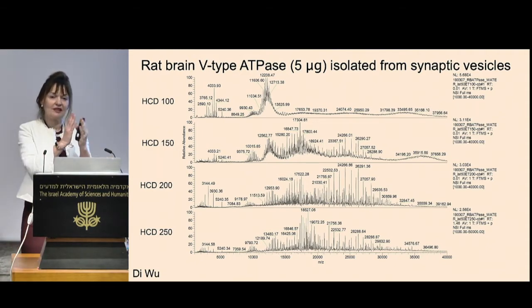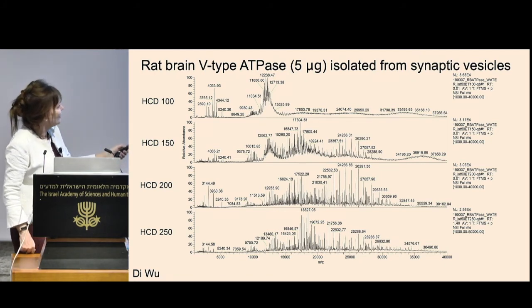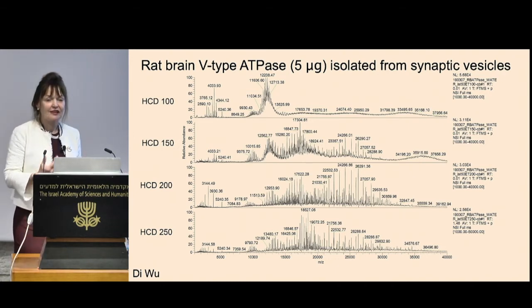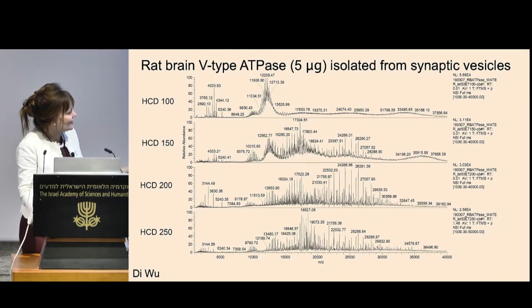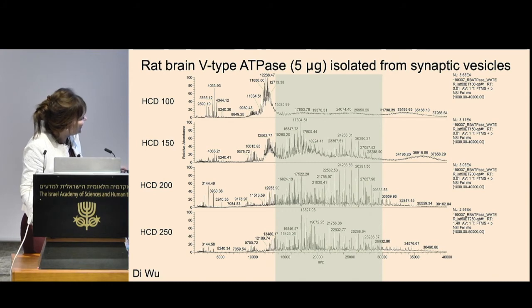these are stripped complexes. So you have your intact, you remove a protein, and the residual bit goes in asymmetric pieces like this. So here's your intact, a protein comes off, you form a product that goes up, and so on. And this is incredibly complex. So you sit there with all sorts of possibilities, and of course we've got programs and software to help us to assign. If you now expand this region, you can see, hopefully, that this is really quite nicely resolved.